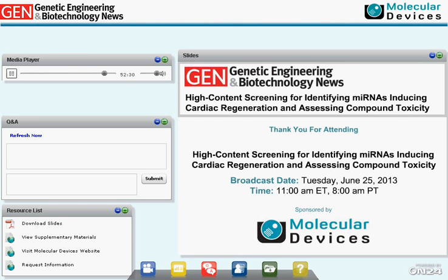I'll start with another question for you. Have you used the contracting cardiomyocyte assay to look at a larger set of compounds? Yeah, we actually tested a commercially available small library, the ScreenWell library from Enzo Life Sciences. It has 131 different compounds. 107 compounds are different types of cardiotoxicity, and then there are 24 control non-toxic substances. We ran that on our system, and actually we saw fairly nice results. We were getting predictivities of almost 90% when using multiple parameters out of the assays. So very, very encouraging results given a small set of compounds.